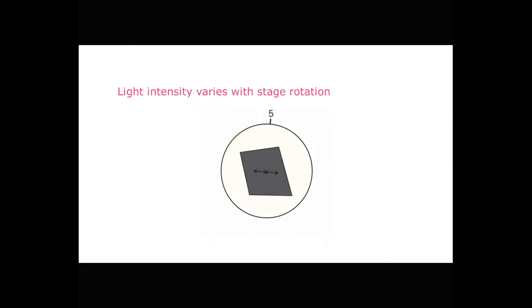What about light intensity? The vibration directions of the two rays depend upon the orientation of atoms within the crystal. So if we rotate the stage like we're doing here, the vibration directions rotate as well.